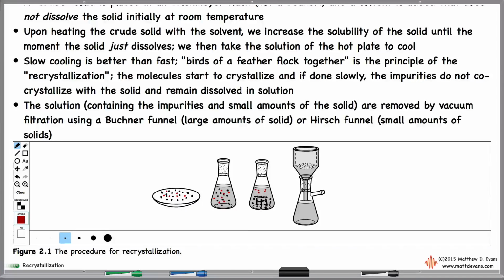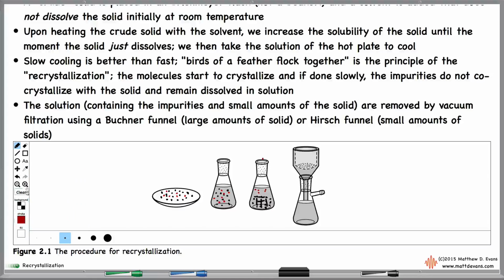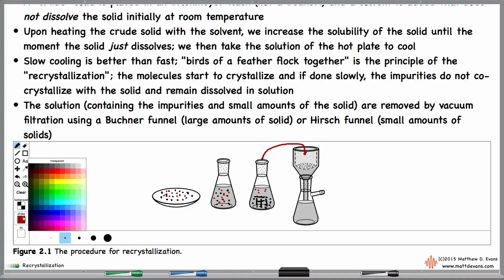And what you do, if the crystals are really clumped up, you take your spatula and you break these up, and then you start swirling the flask, and then this whole thing gets dumped at this point. The whole flask and all the contents. Why is this not working? I can't get it to work, so we're just going to do this. So you dump the whole set of contents in here.